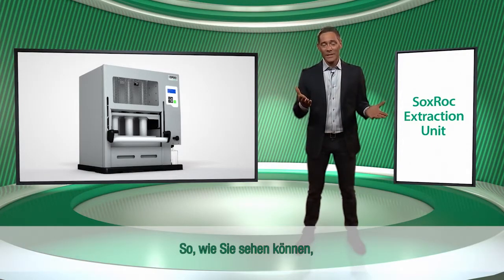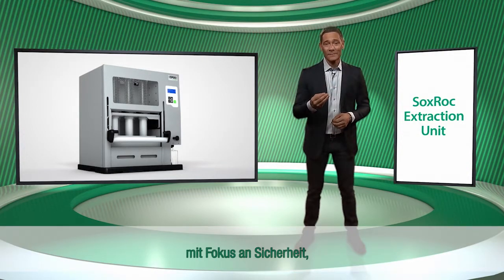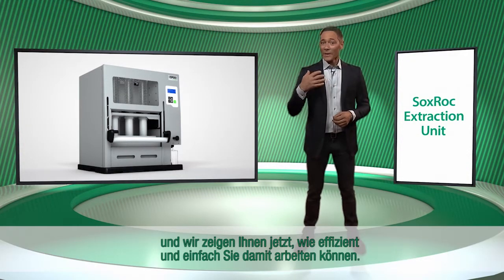As you can see, the Soxrock Extraction Unit is an instrument designed with safety in focus. We will now show you how efficiently and easily you can work with it.